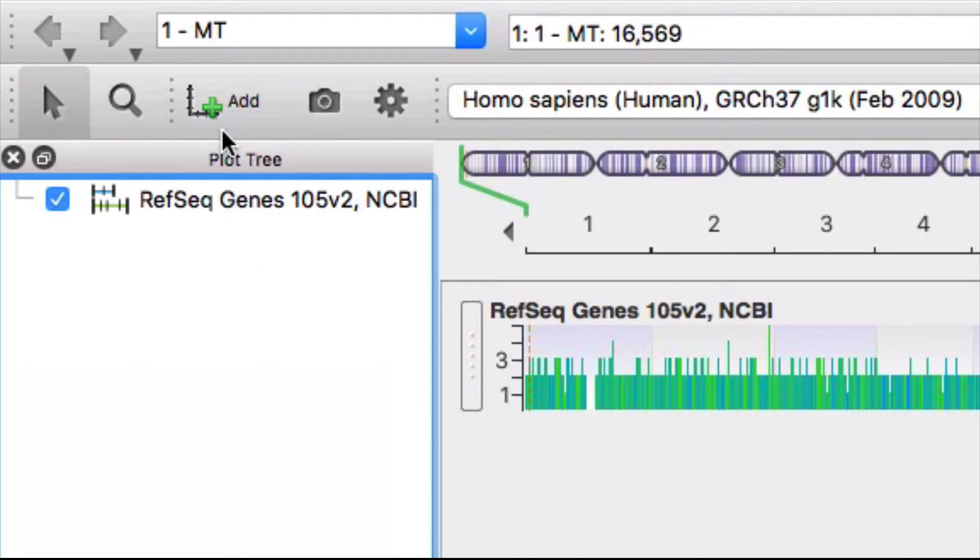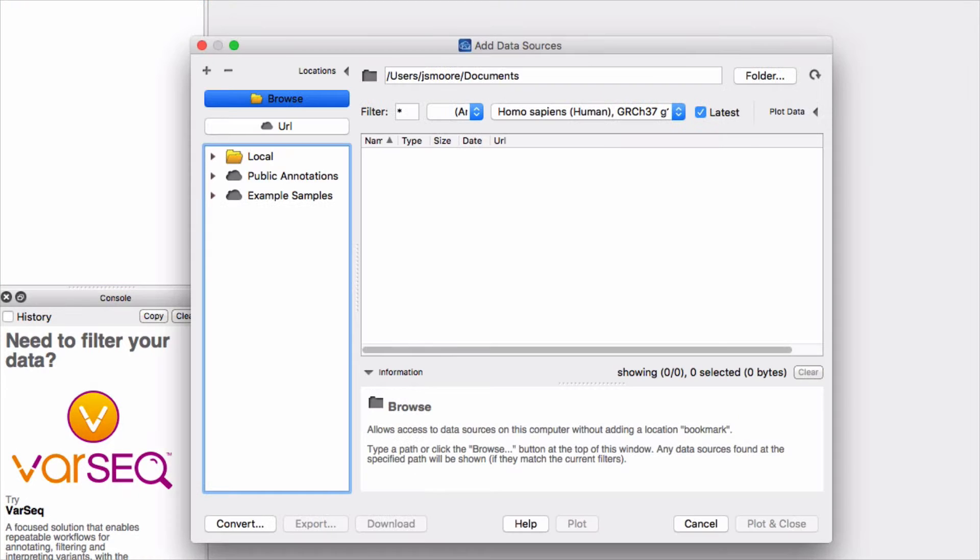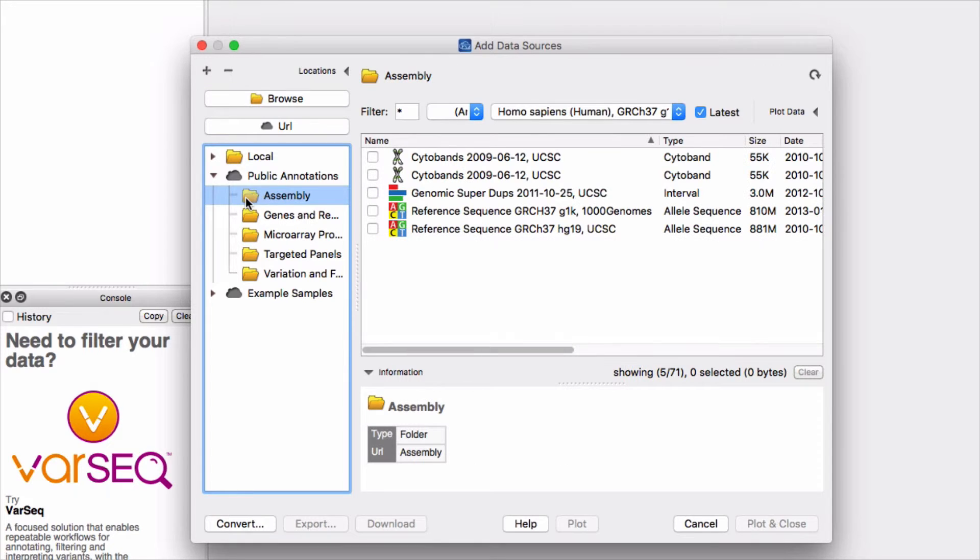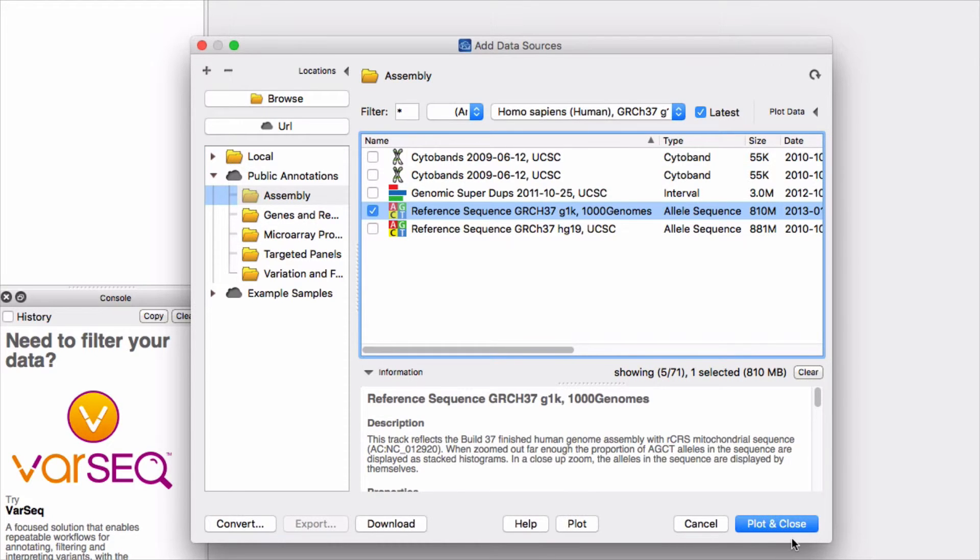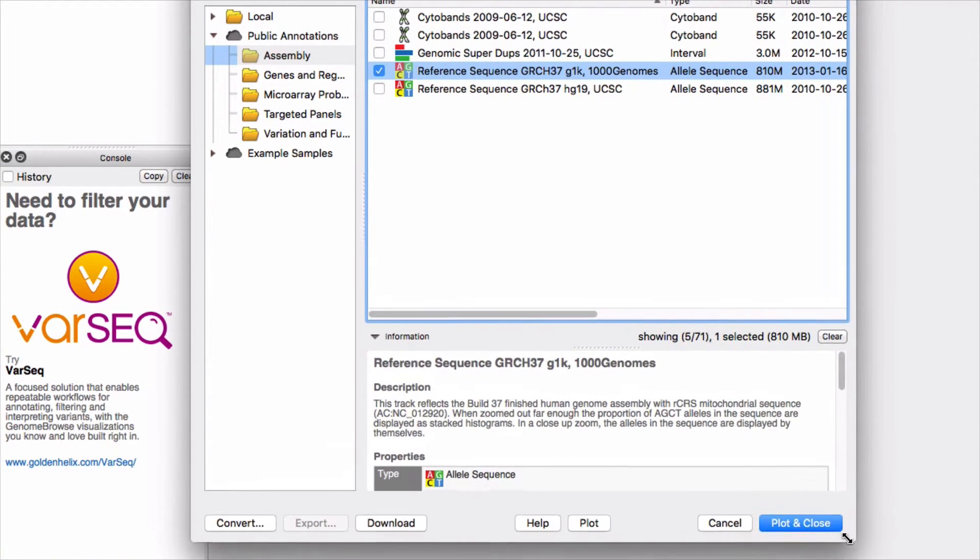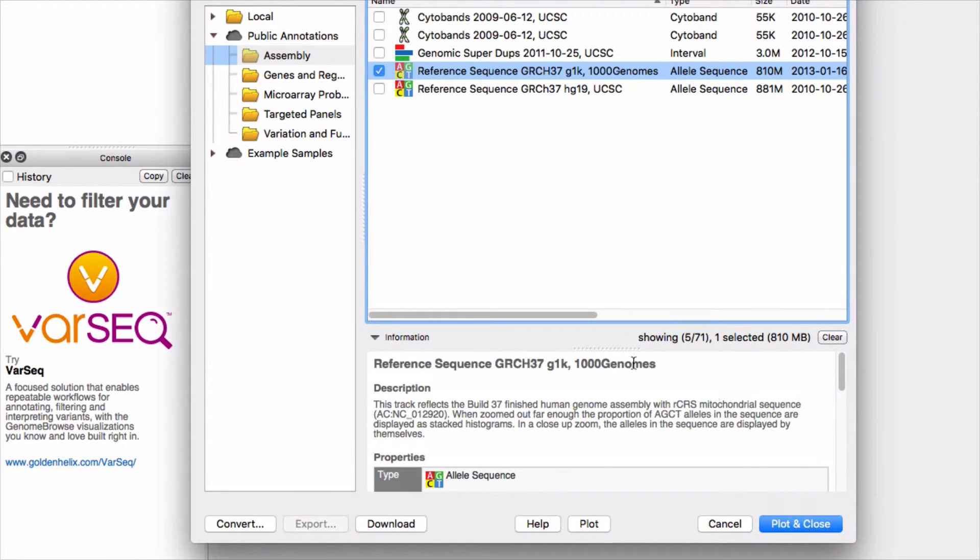Let's add a track that displays the complete human reference sequence. Click on the add button found in the upper left corner. You'll find the reference sequence in the assembly folder. Inside the public annotations folder, a description of the file is available in the information window at the bottom.